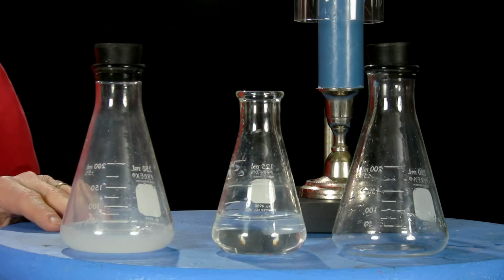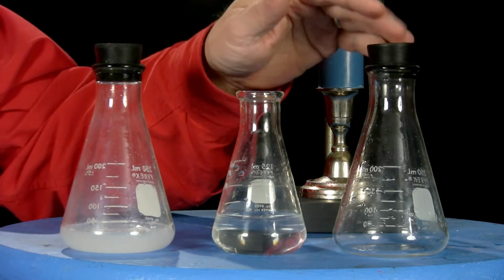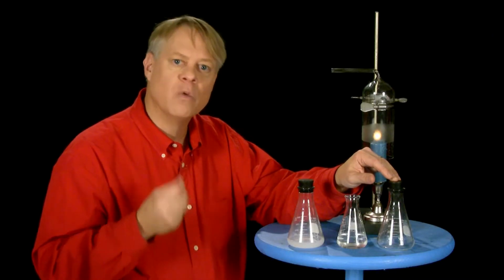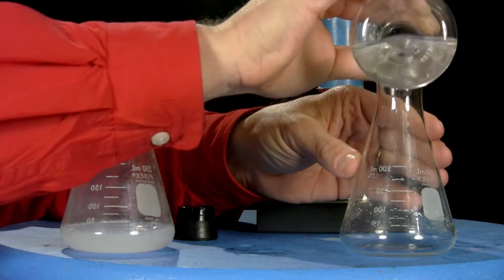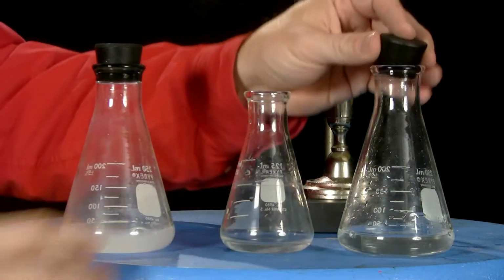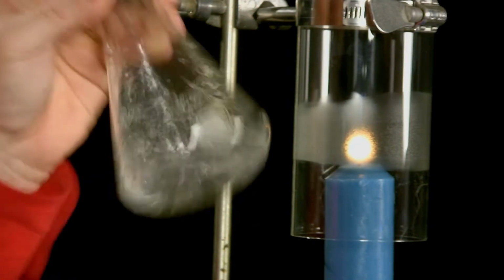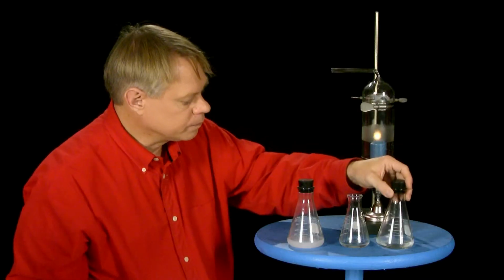You see that the water has become quite milky. Observe, this will not happen with air merely. Here is a flask filled with air, and if I put a little lime water into it, neither the oxygen nor the nitrogen nor anything else that is in that quantity of air will make any change in the lime water. It remains perfectly clear. And no shaking of that quantity of lime water with that quantity of air in its common state will cause any change.